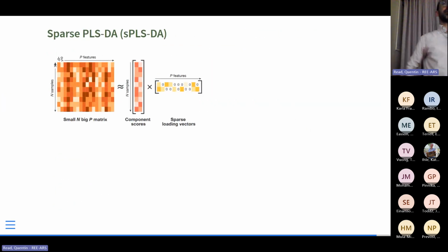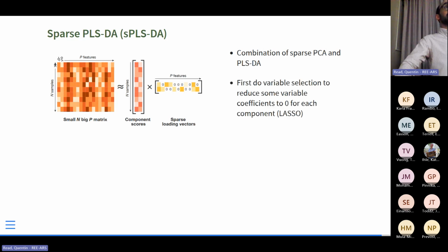And then we're going to do sparse partial least squares, sparse meaning having a lot of zeros in it. It's just like the PLS, except that it tries to reduce the complexity of the data even further by turning a lot of the loadings for the different variables to zero using a variable selection approach.